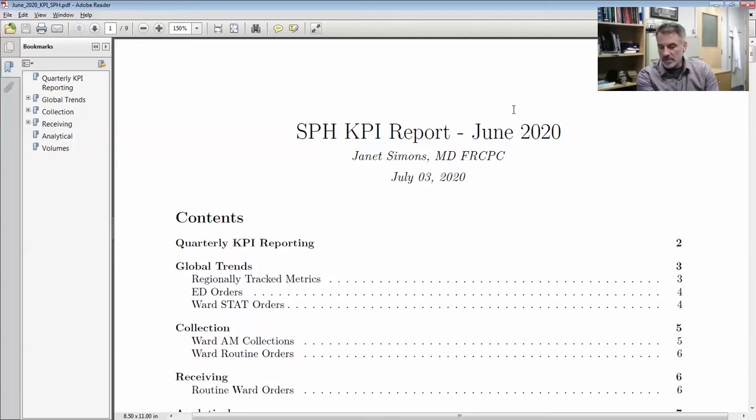But as you know, one of the things we need to do frequently is produce key performance indicator reports or some other static report, or even a research paper. This permits you to entirely code a research paper so that everything in it, including the tables and the figures and the inline text that constitutes numbers, are constructed on the fly. If you alter the original document, the finalized document for upload will be generated by the script. Now, that's a later stage thing that you would do.